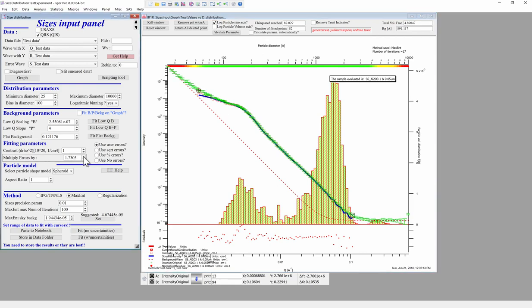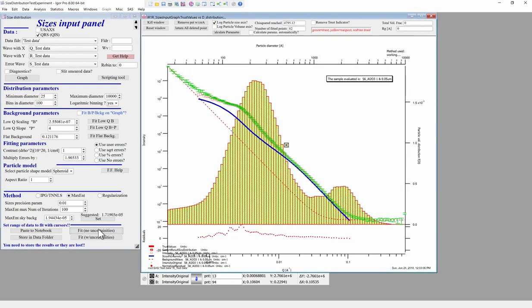And so my suggestion is just, you know, find an appropriate one which is working hard enough, but is not overdoing it. And it's very difficult to say what is the right number. My typical number, which I'm getting on my data, is somewhere between 15 and 20. If it goes 25, 30, the limit is 100, it gets ridiculous.